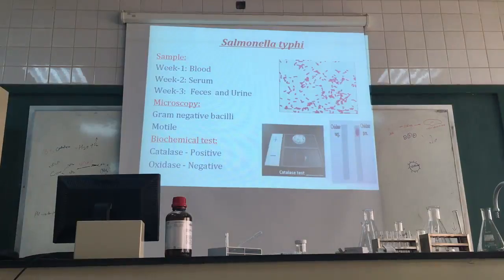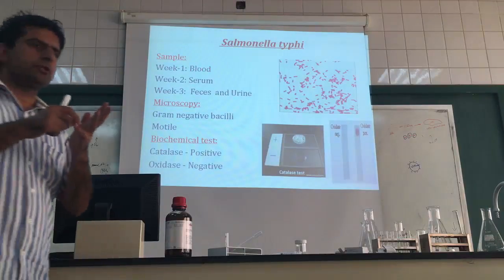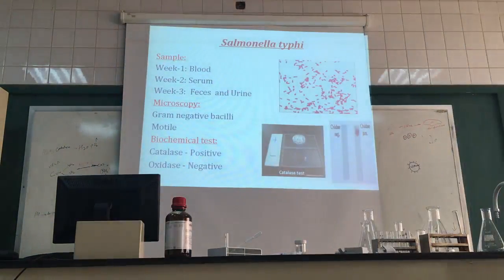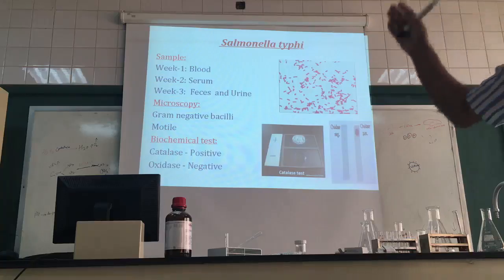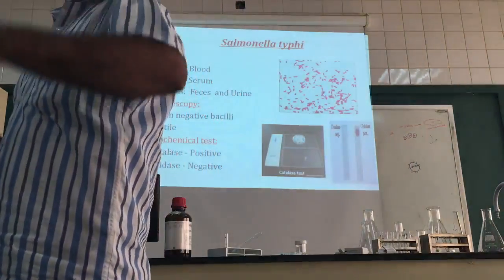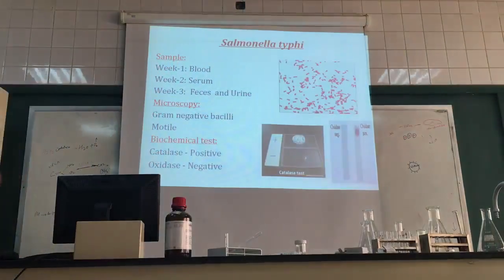Salmonella typhi, the first microbe. It's a waterborne disease. Even if you see Bangladesh, India, Nepal, Pakistan, where there are not well-developed sanitation systems, you will find this bacteria. So please take care, the flame is on. Maybe by mistake it will fall down or something like this. So how to identify this Salmonella?